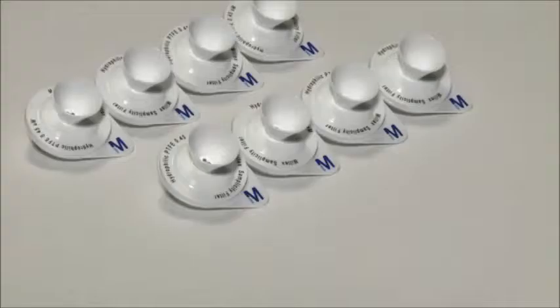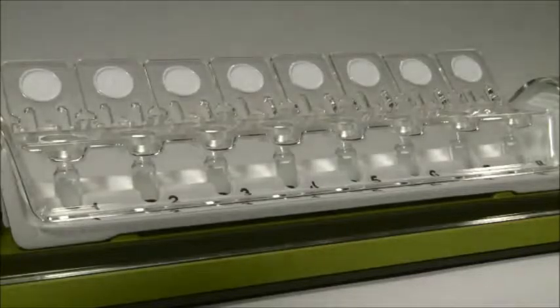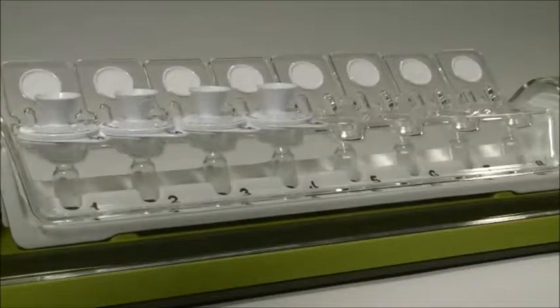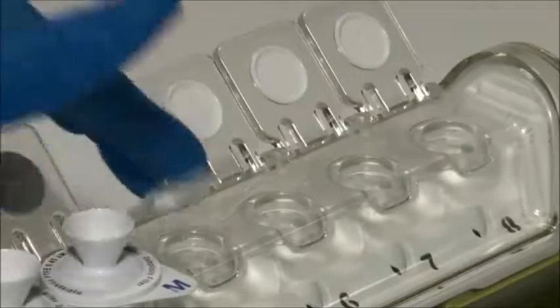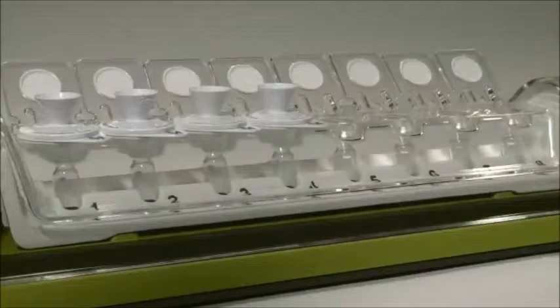The Millex Simplicity filters are provided in strips of 4 for fast setup. The strips are perforated, so if you have fewer than 4 samples, it's easy to tear off the number of filters you need. Place the filters on top of the Simplicity unit. If you're filtering fewer than 8 samples, firmly close the lids of unused filter positions.